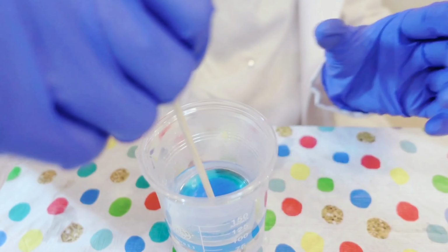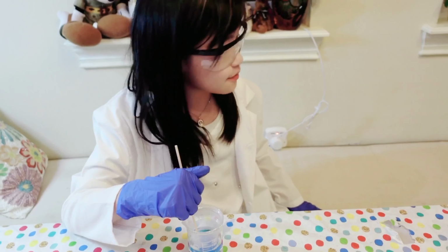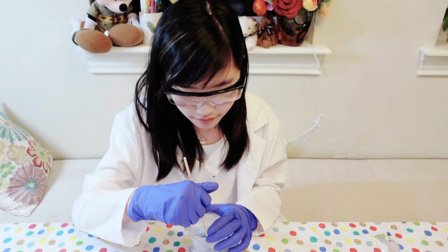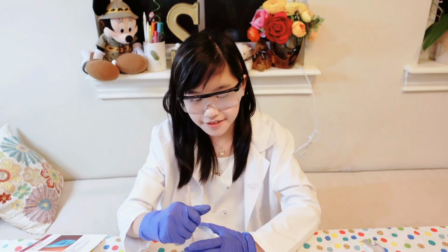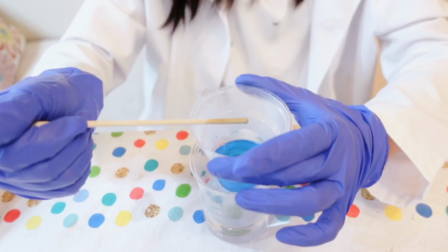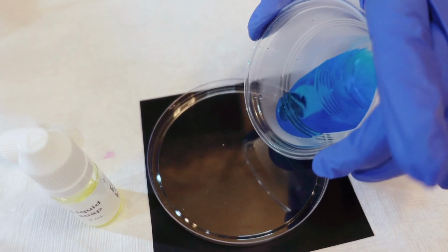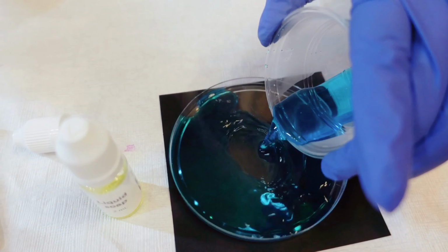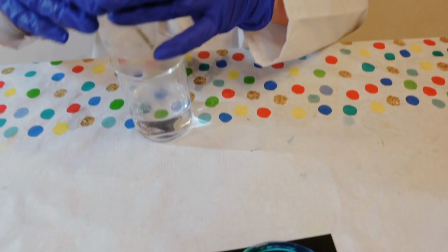So I'm gonna set a timer for 2 minutes. Okay, Google, set a timer for 2 minutes. 2 minutes, starting now. Okay, Google, stop. So it has been 2 minutes. So now I'm going to get the solution and pour it onto the Petri dish.